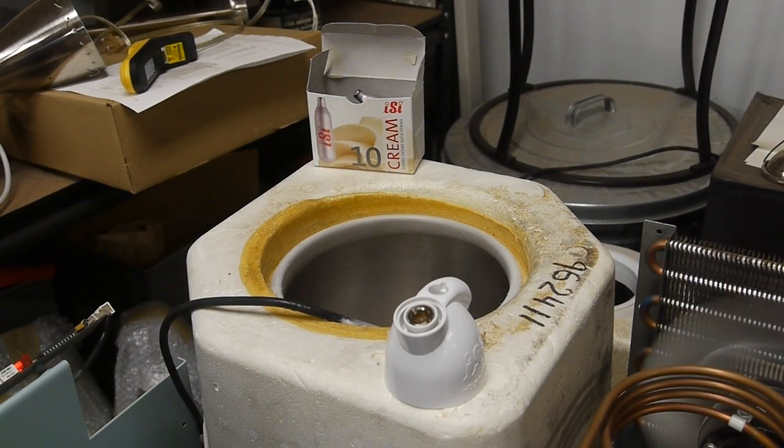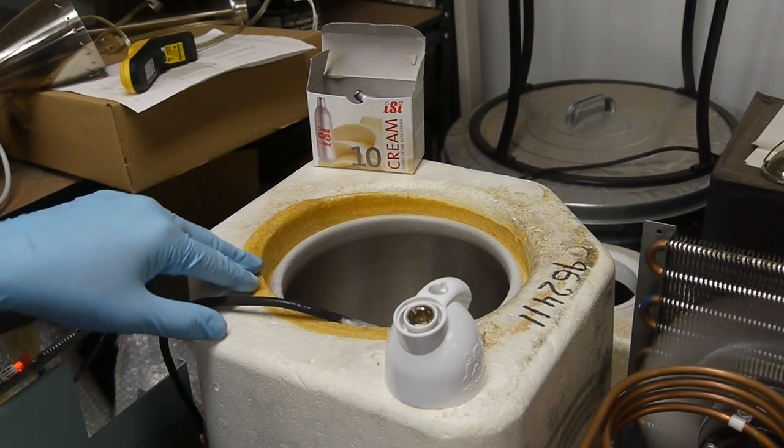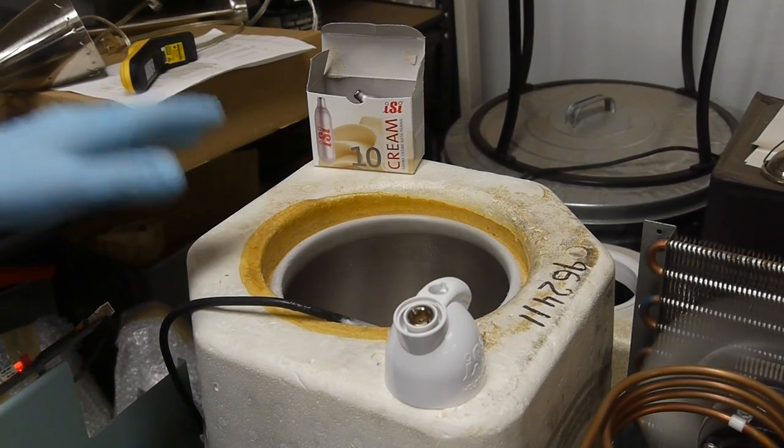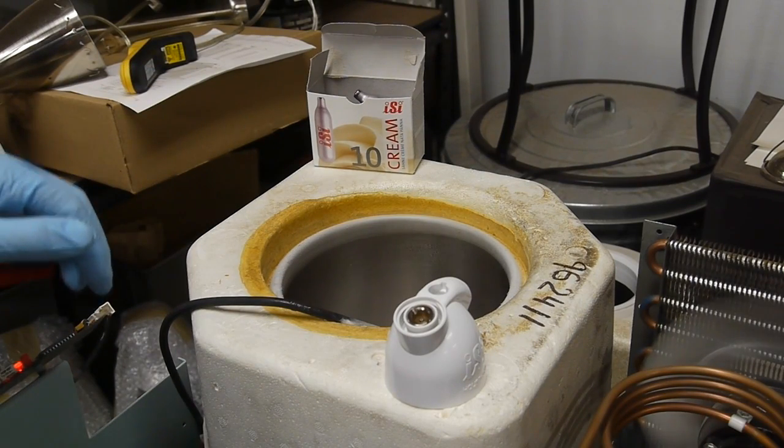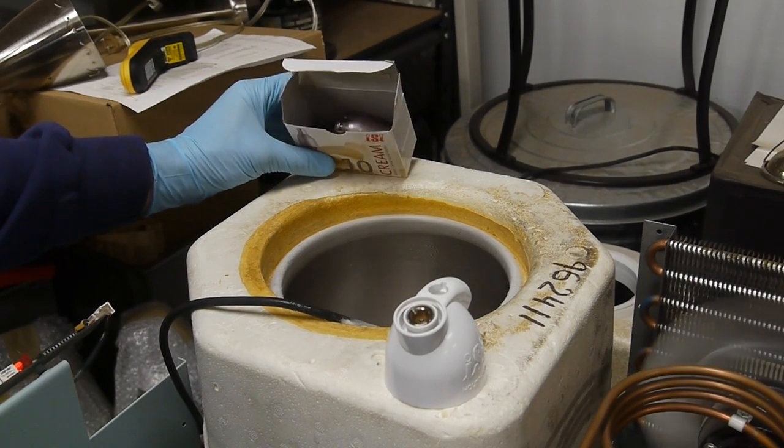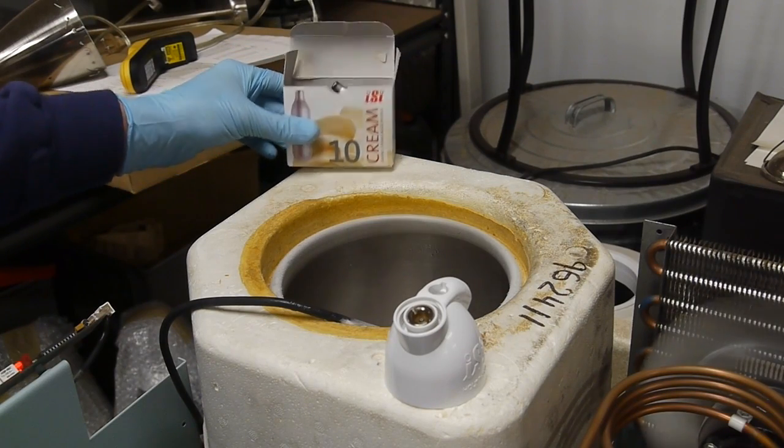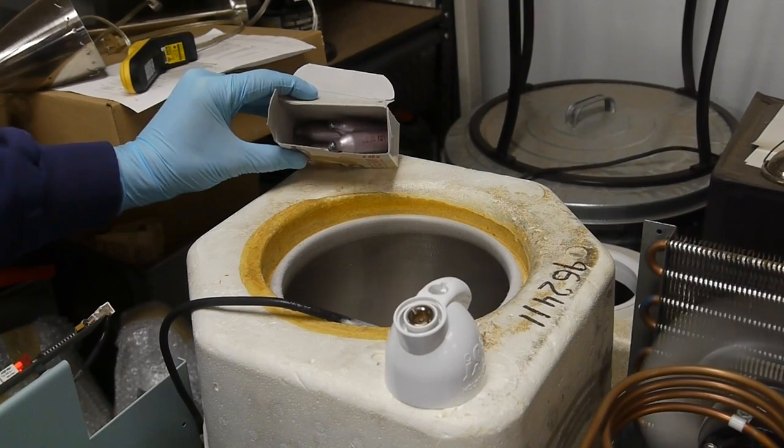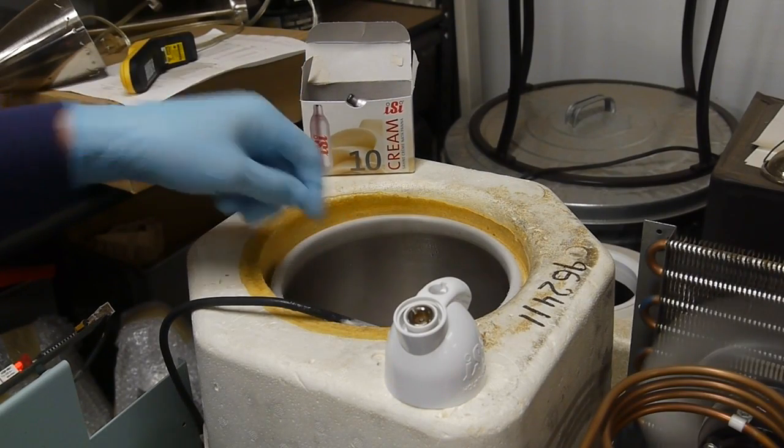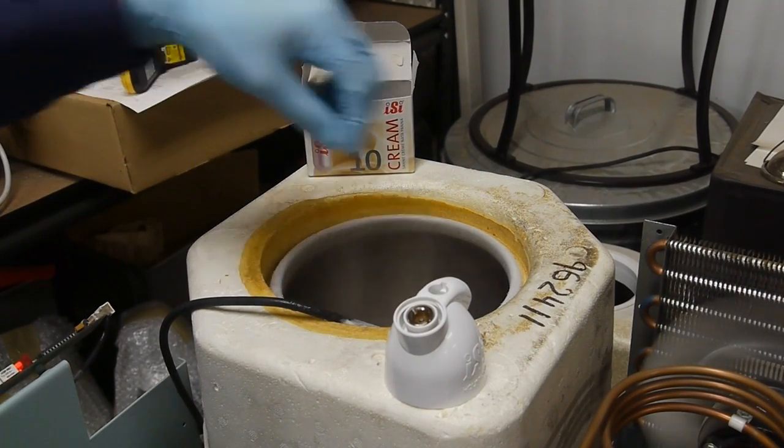In a previous episode, I described how I repaired this negative 100 degrees C freezer. One of the things we can do with those low temperatures is liquefy nitrous oxide. I've got a bunch of these little nitrous oxide cartridges that are sold for making whipped cream at home, and down in the cold chamber I've got a couple of these cartridges.